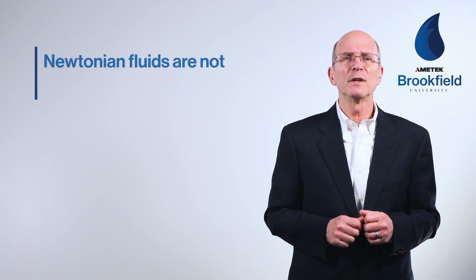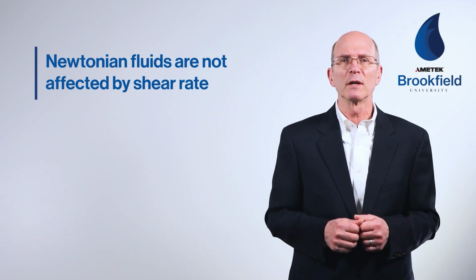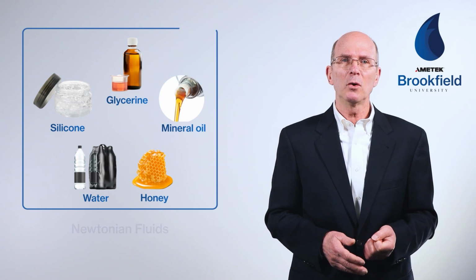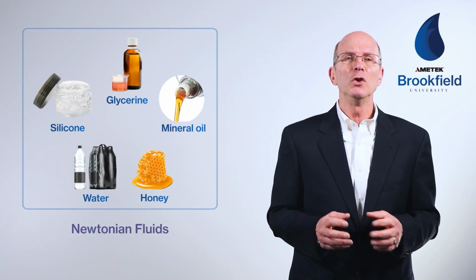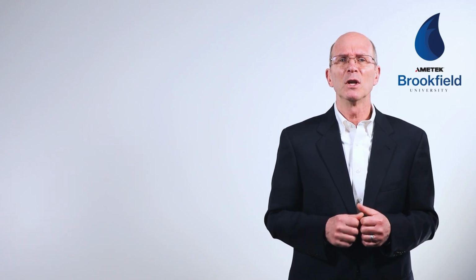Newtonian fluid viscosity is not affected by shear rate and remains stable over all shear rates. Mineral oil, water, honey, silicone, and glycerin are examples of Newtonian fluids. Non-Newtonian fluids can exhibit several types of behavior.